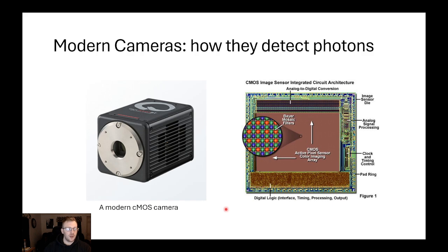Modern microscope cameras do not look like the camera that you probably think of when you think of a camera, right? They don't have a lens, they don't have a lot of the other parts. The lens of this camera is the microscope. The rest of it works just like your phone or any digital camera you've seen before. It's just using the microscope as the lens as opposed to having a lens attached directly to the chip. On this camera, you can see we have an opening. This is what's going to allow light to come through, and behind that opening, there's a chip that's going to detect things. This camera is an Orca Fusion made by Hamamatsu, which is one of the cameras that we use on our microscopes here at the University of Wyoming.